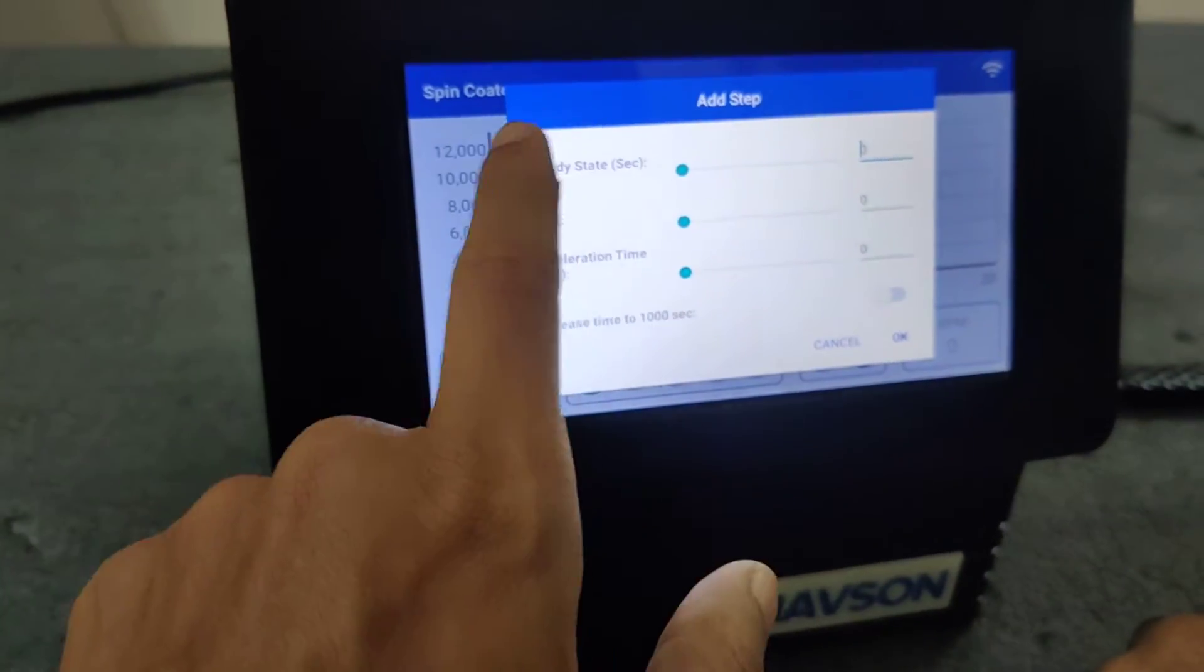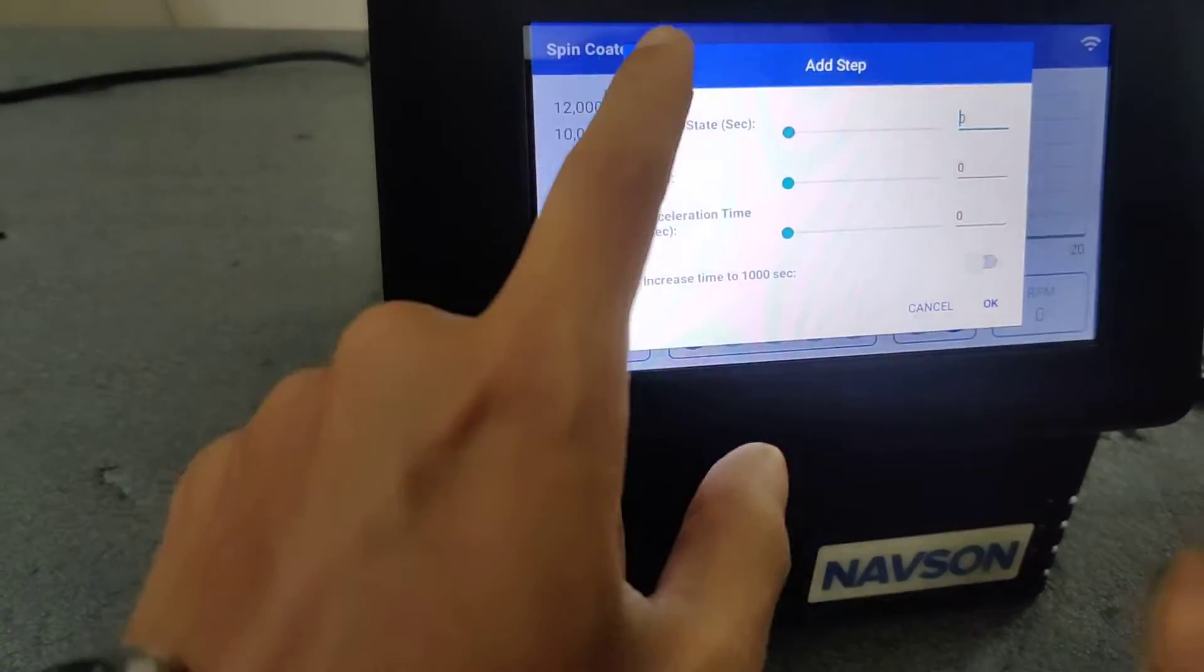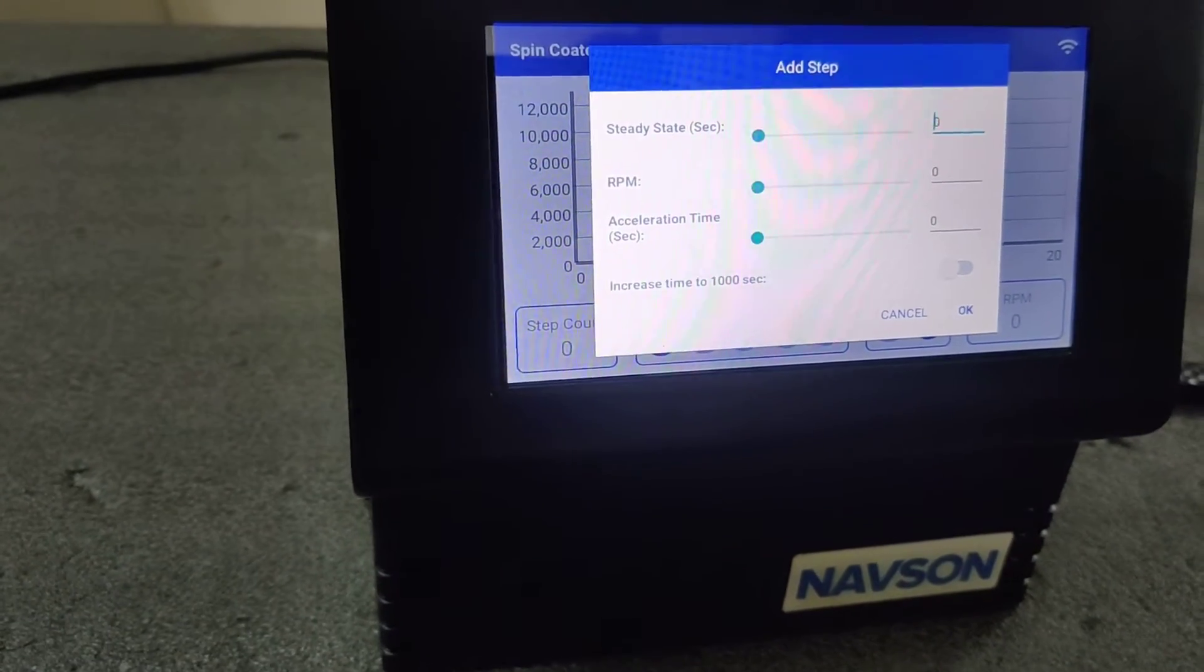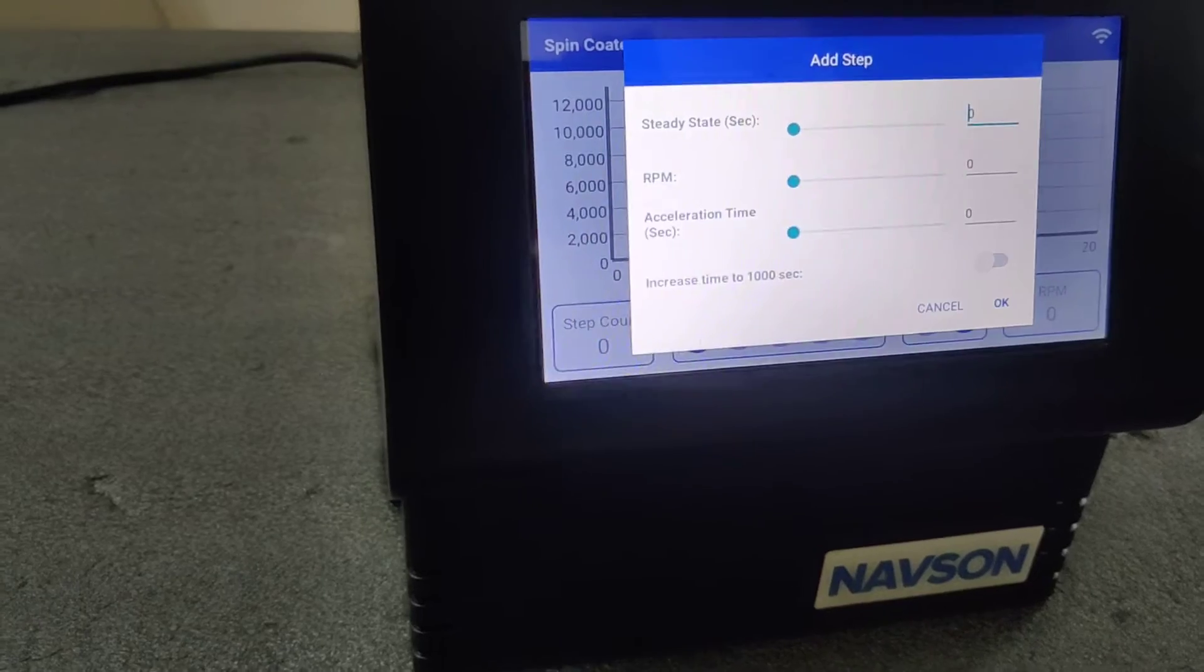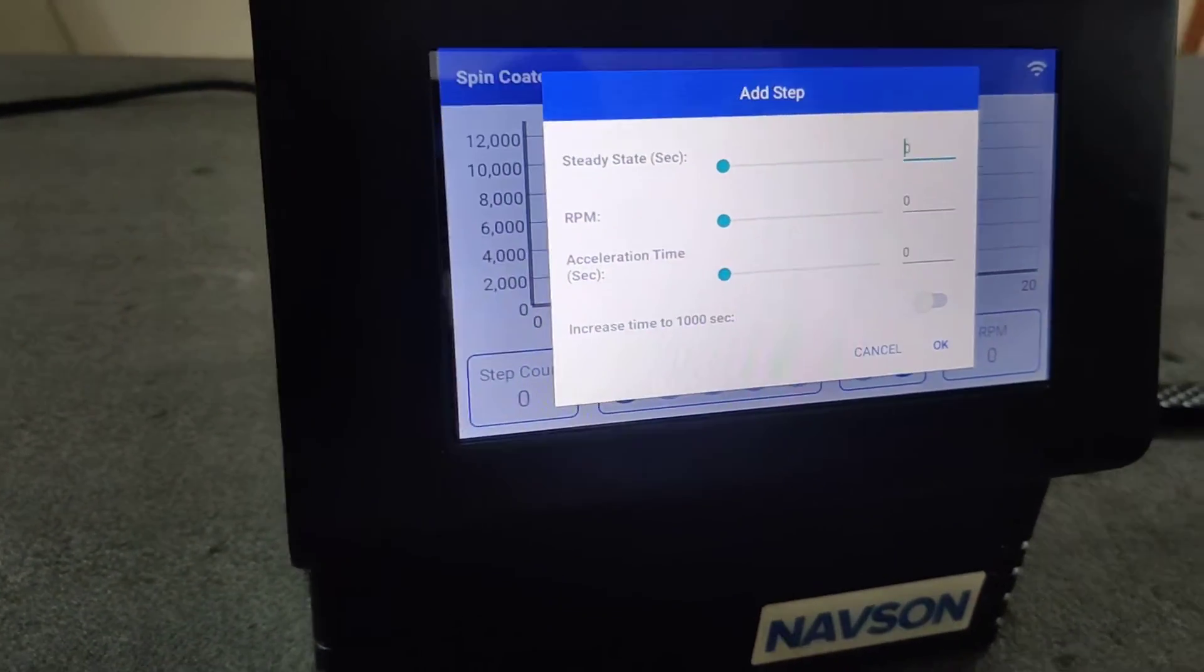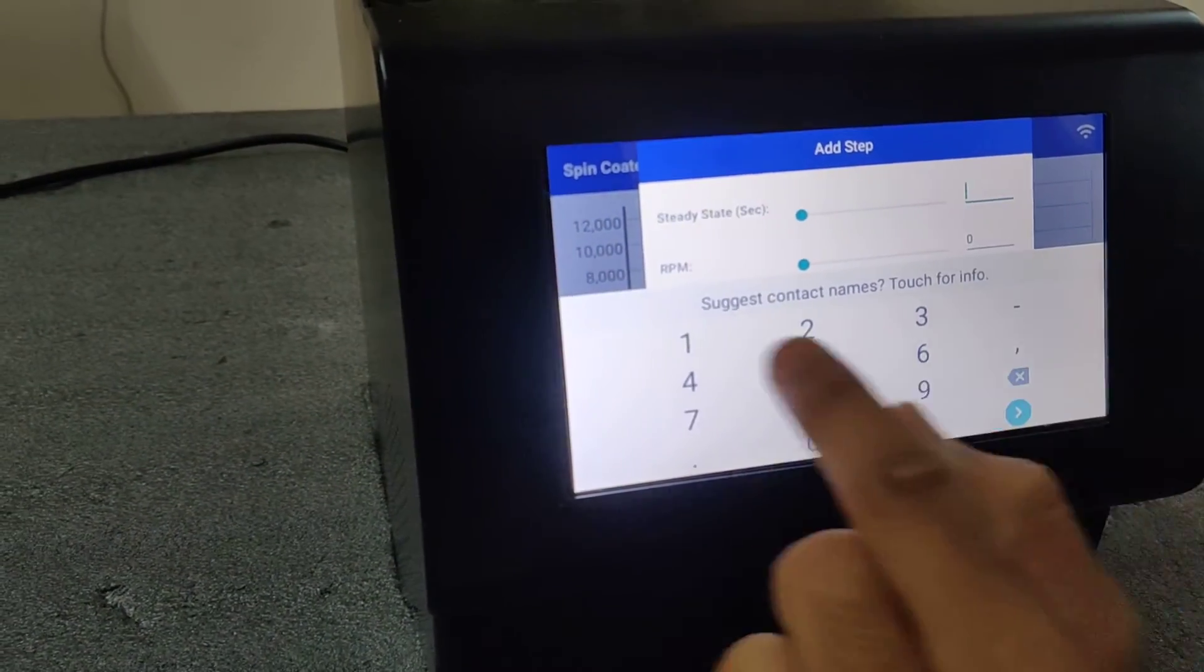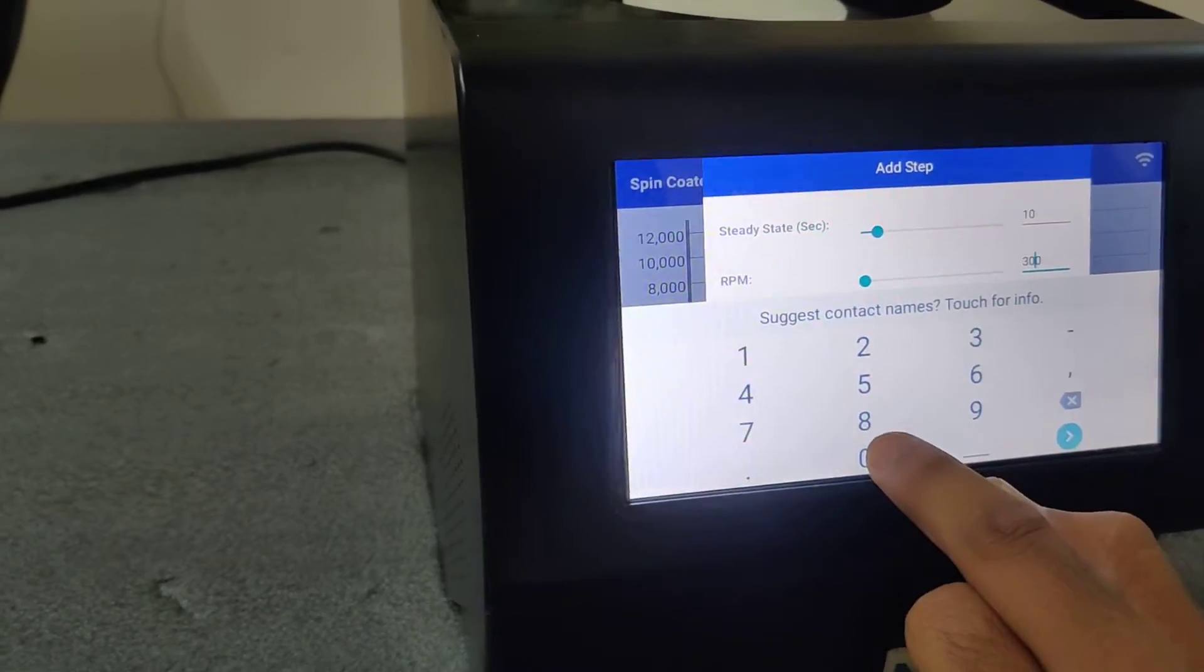So it asks for steady state RPM and acceleration time. Steady state is the term when you need to tell the system at which RPM you need to stay for how many seconds. Say you need to ramp up to 3000 RPM and stay for 10 seconds, then you mention 10. So like after reaching 3000 RPM, it stays at 10 seconds.